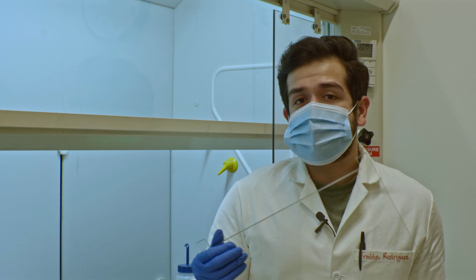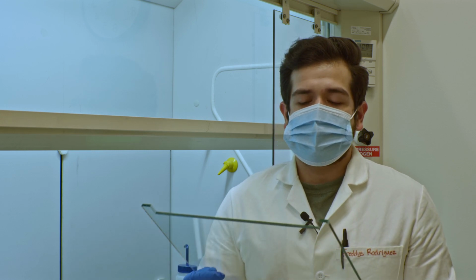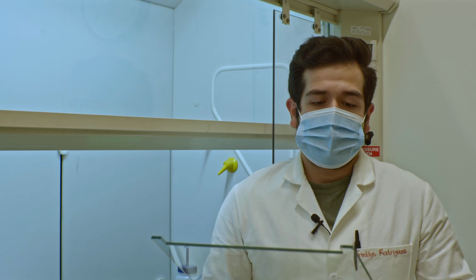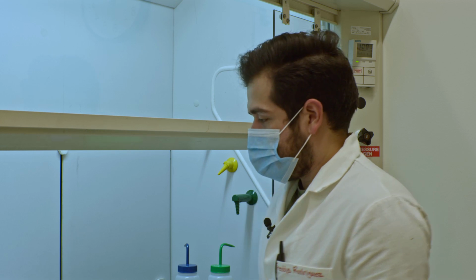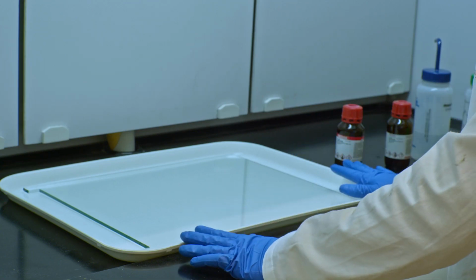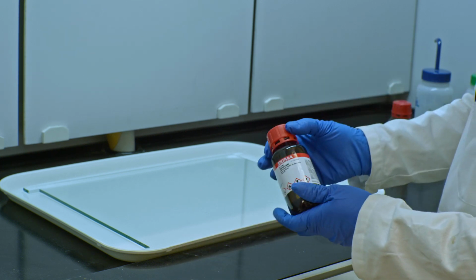So the best way to do this is by siliconizing it, which adds a hydrophobic layer to the glass and makes it really easy for your gel not to stick onto the glass and also pop it off at the same time. So to do this, whenever your glass is nice and clean, you should go to a hood. Once you have placed the glass plate in the hood, the next thing you want to do is get a siliconizing reagent.